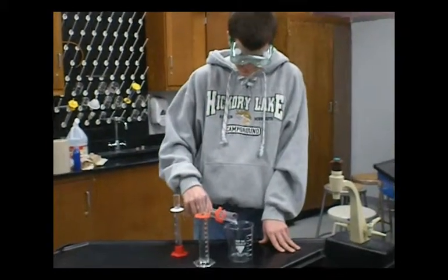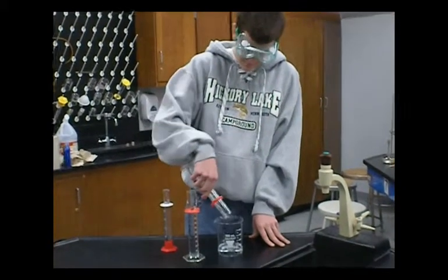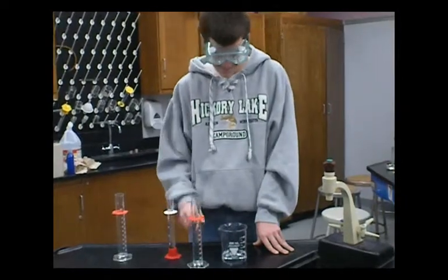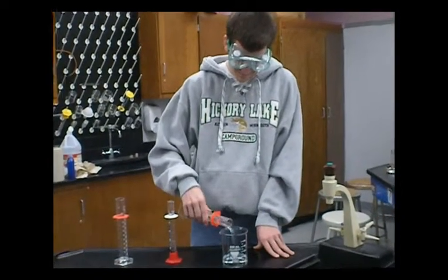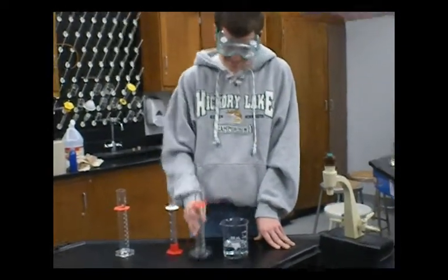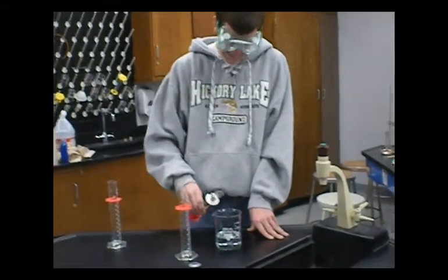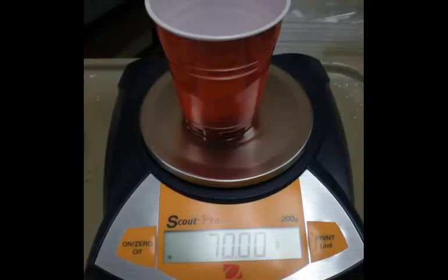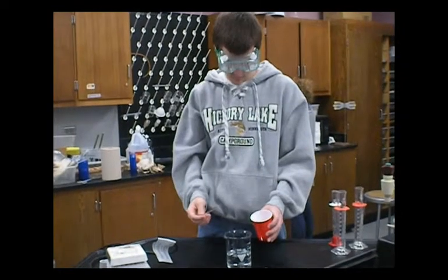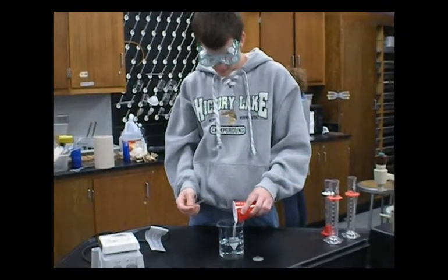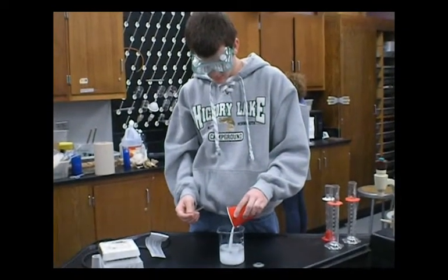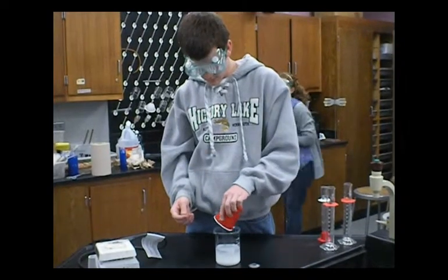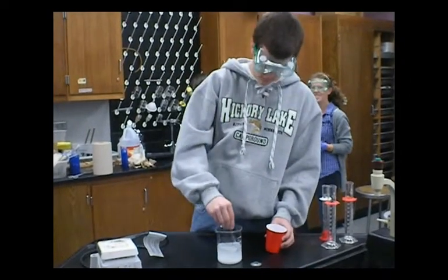Add 250 milliliters of water to a 600 milliliter beaker. Add 70 grams of NaCl to the water, then stir.